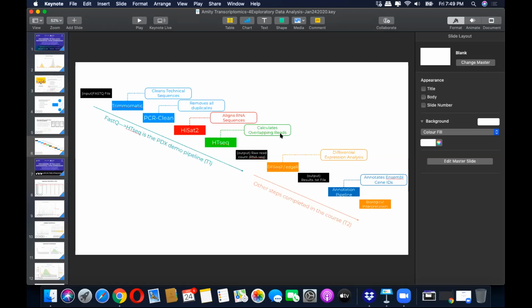Now we can do what's called the first downstream analysis. That would be statistical analysis. Which kind of statistics do we need to identify what here is signal and what here is noise?